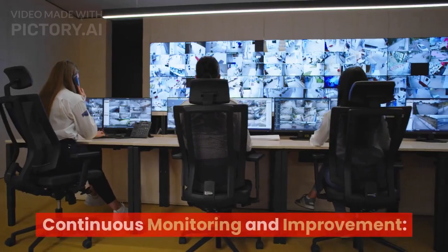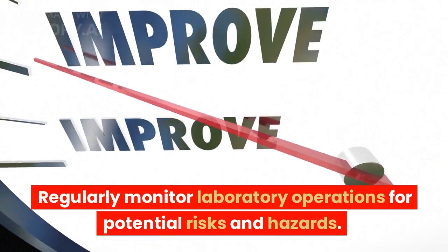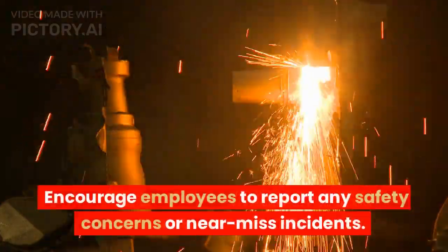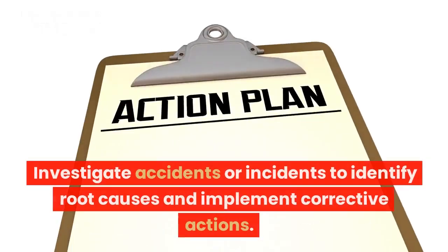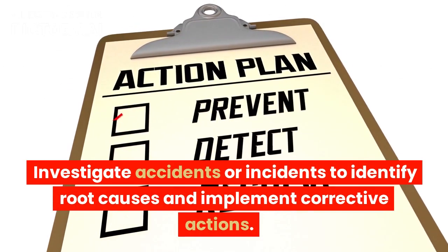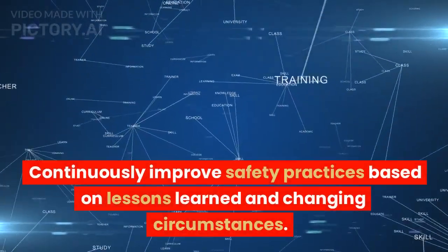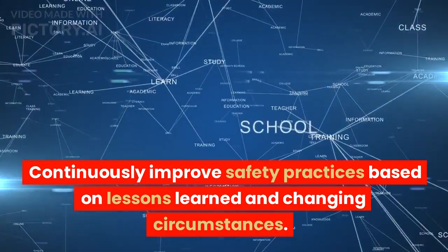10. Continuous monitoring and improvement. Regularly monitor laboratory operations for potential risks and hazards. Encourage employees to report any safety concerns or near-miss incidents. Investigate accidents or incidents to identify root causes and implement corrective actions. Continuously improve safety practices based on lessons learned in changing circumstances.